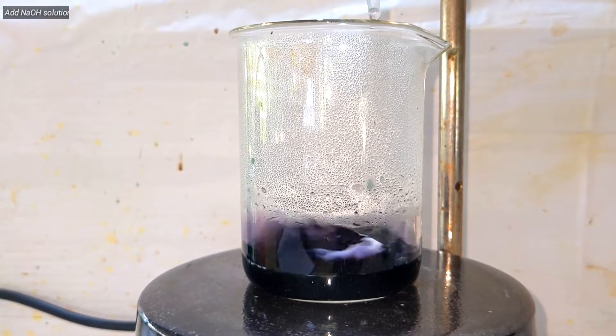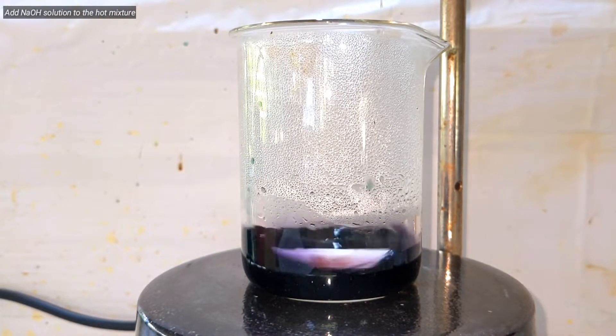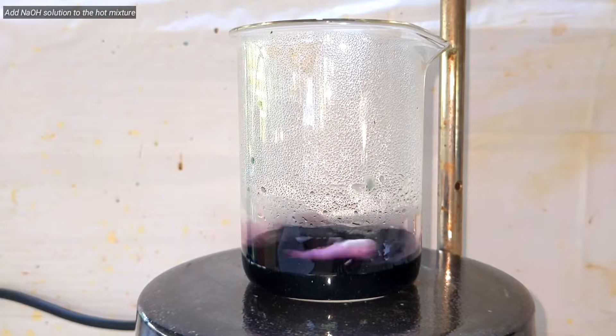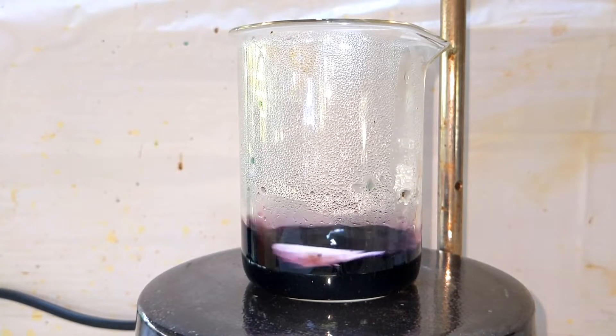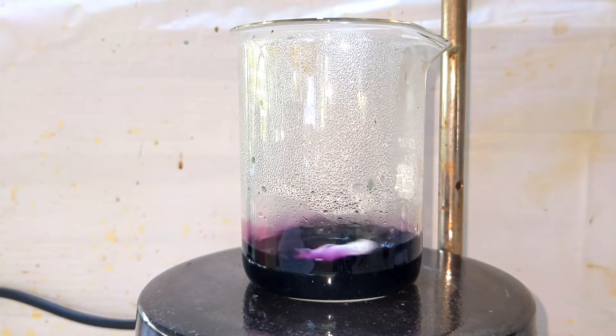You can clearly visualize the color change that is happening. It was initially green and later, after the addition of sodium hydroxide, a purple color is formed which is very similar to the potassium permanganate solution.